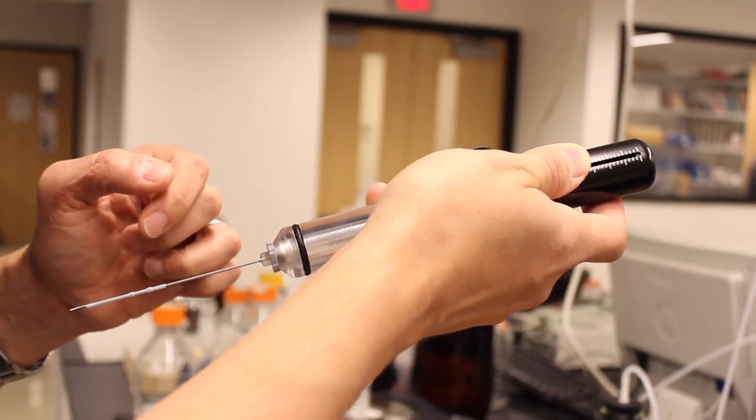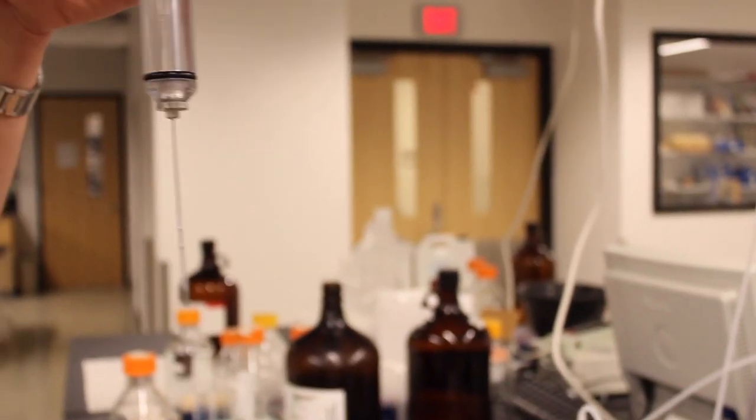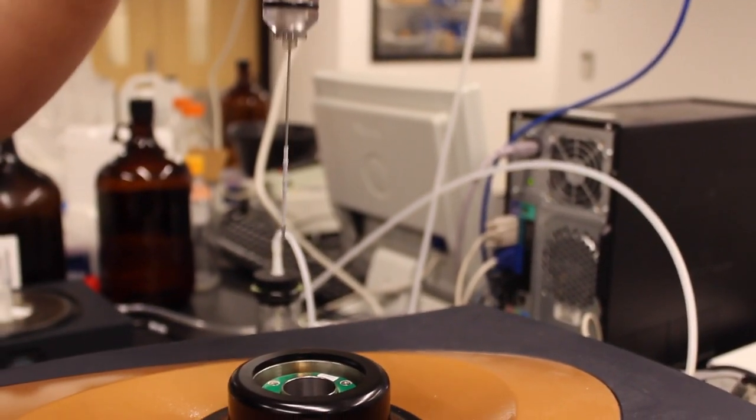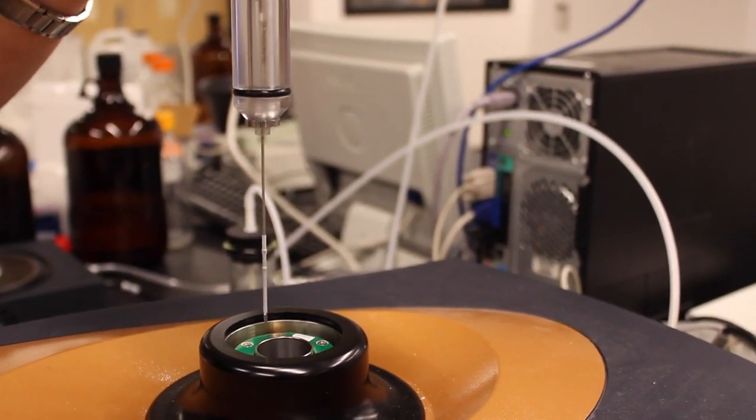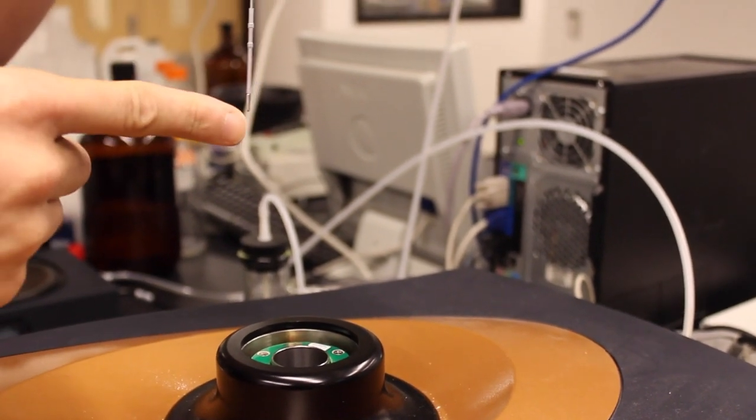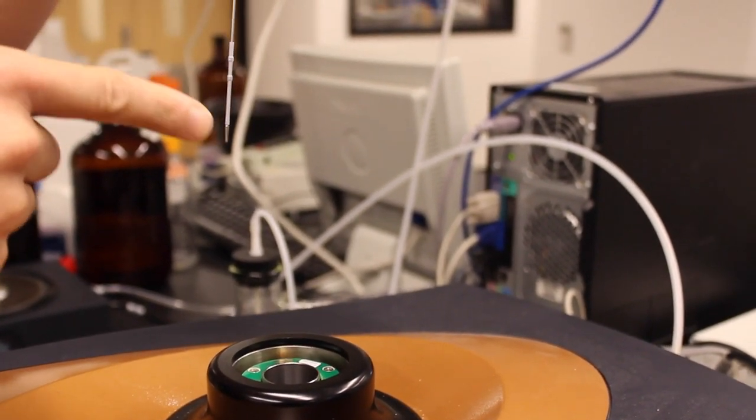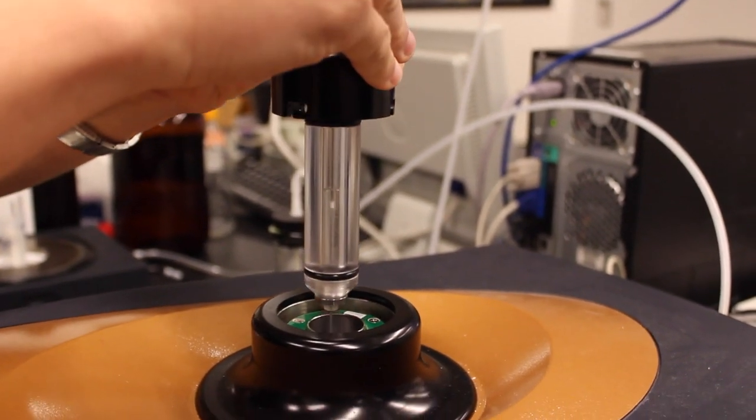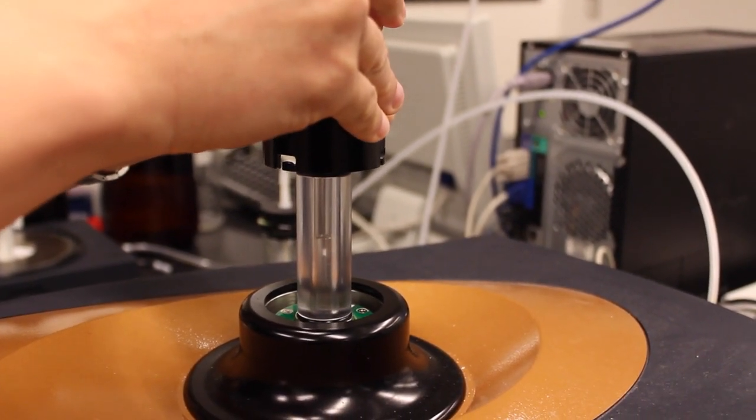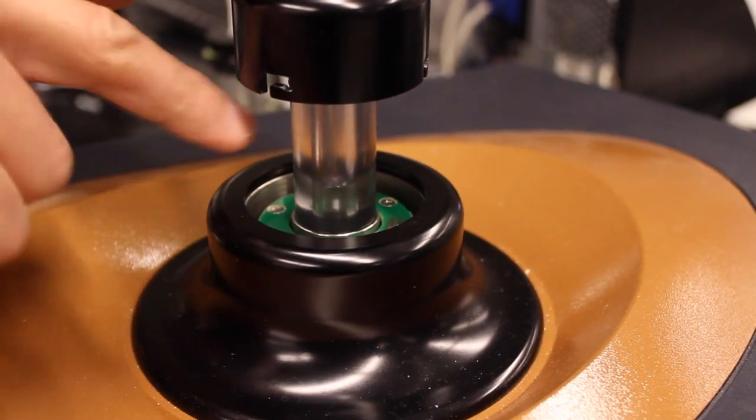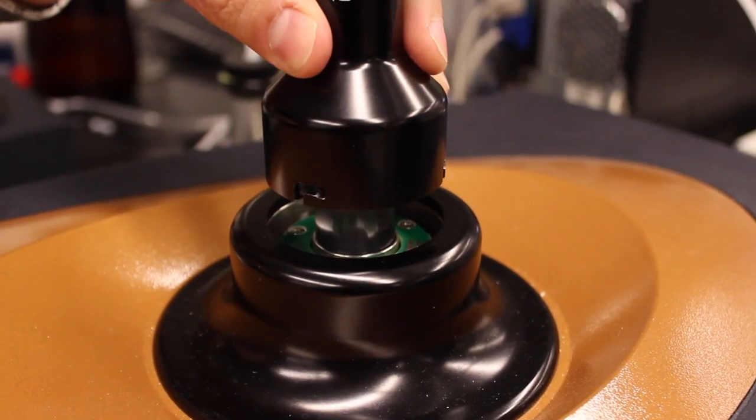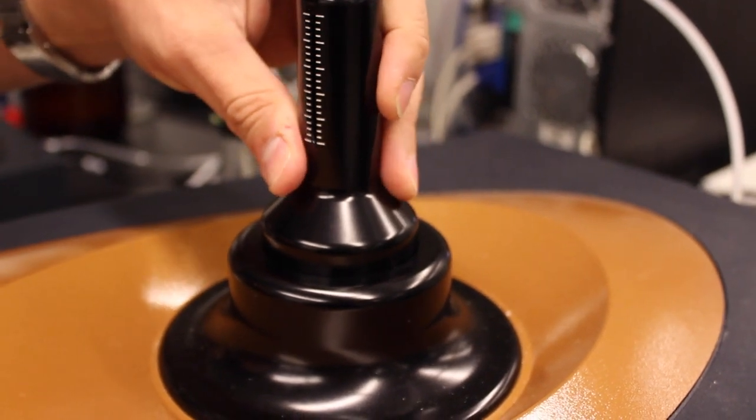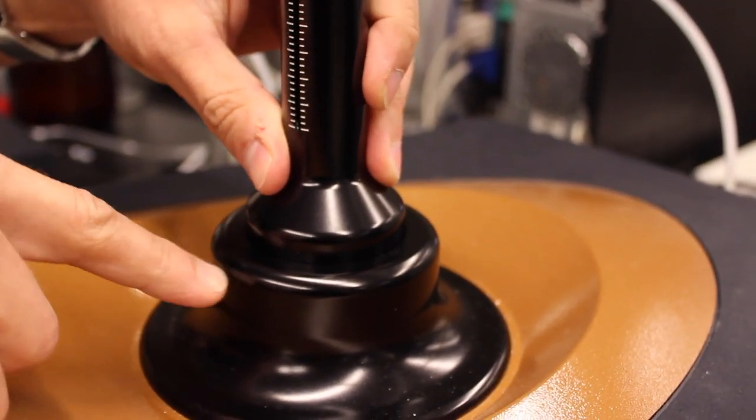Now we're going to install it back into the instrument so being careful to keep everything aligned vertically so that we don't damage or bend the needle. We're going to insert it into the housing here.